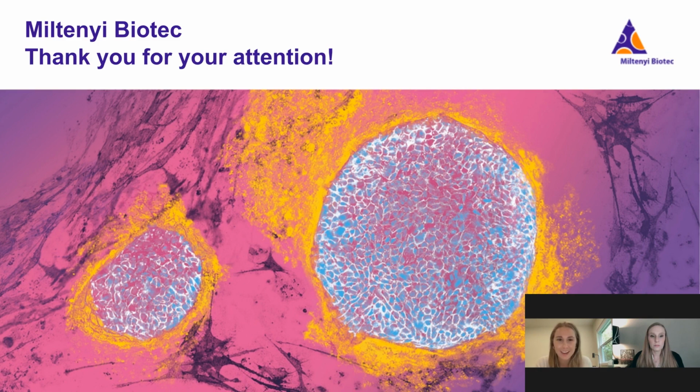Now let's get started. Our first question is, can I take advantage of my own automated analysis pipeline in combination with the MACSIQ View software?